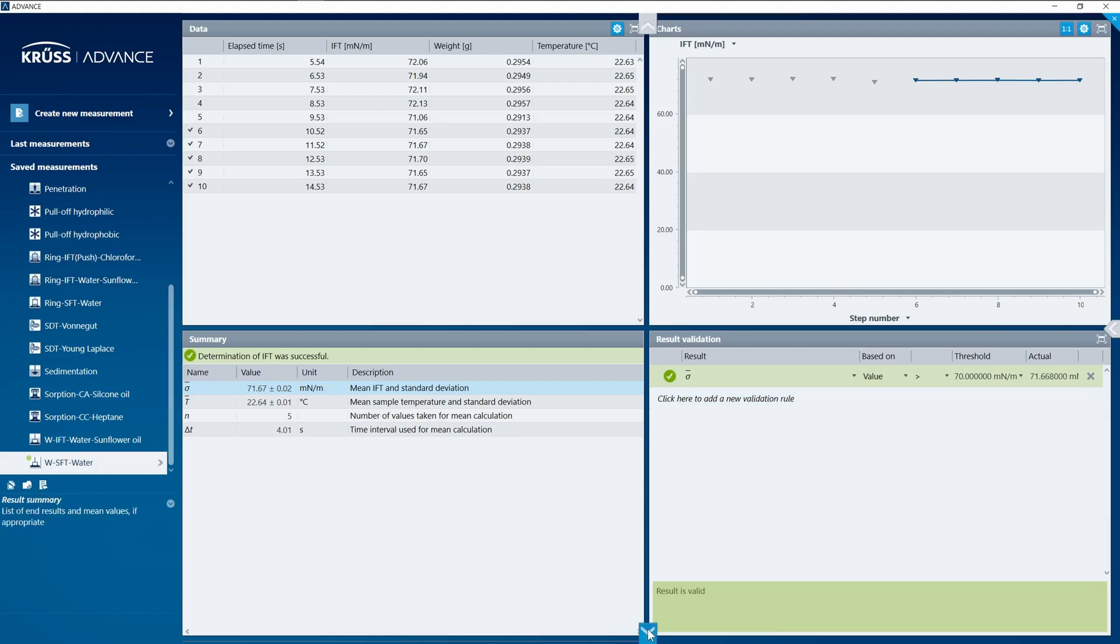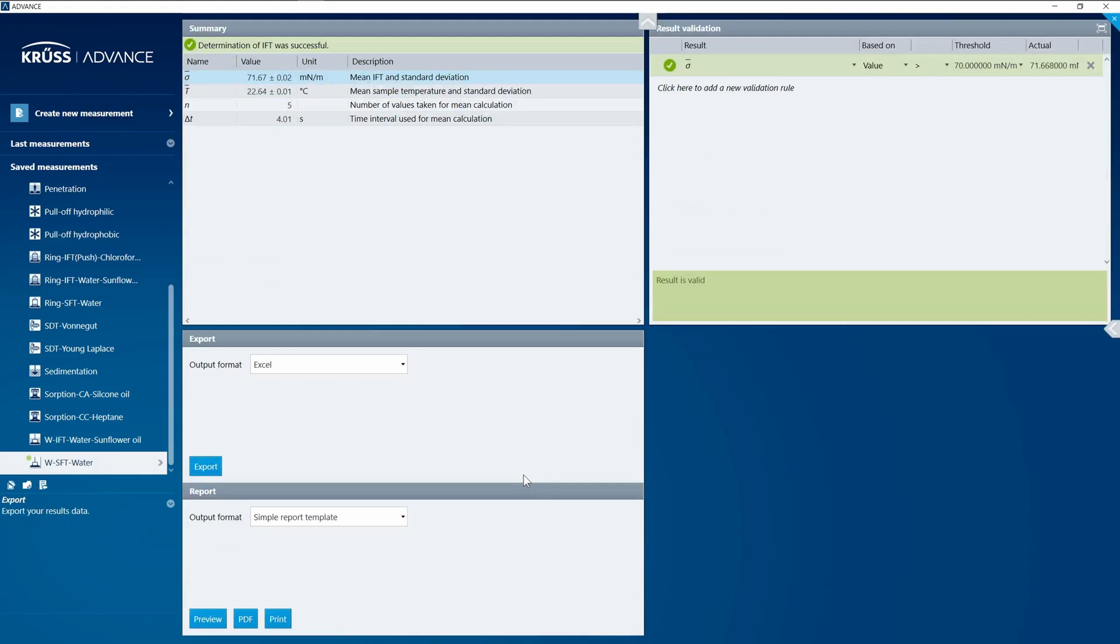If I go now to the very bottom, when my measurement is finished I can even export the results directly to Excel or as a PDF.